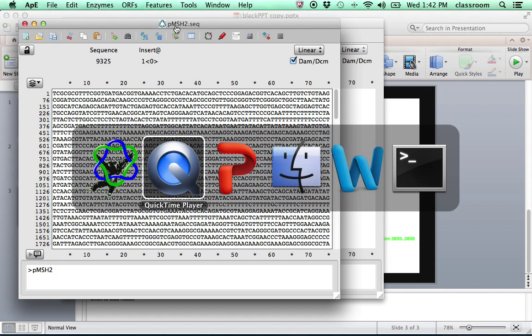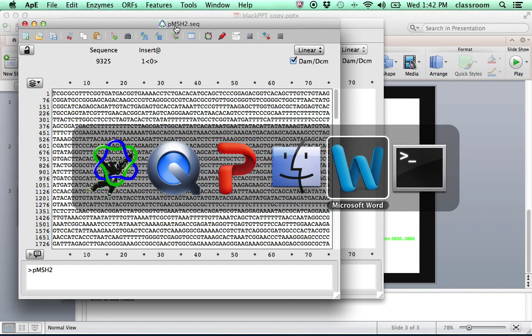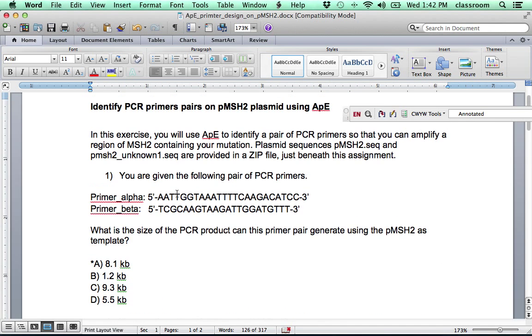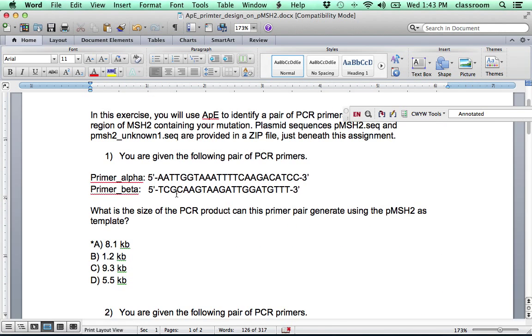Now, then we go to the assignment. The first question says we are given the following pair of PCR primers, primer alpha and beta. And the question asks, what's the size of the PCR product of this primer using the pMSH2 plasmid sequence as a template?